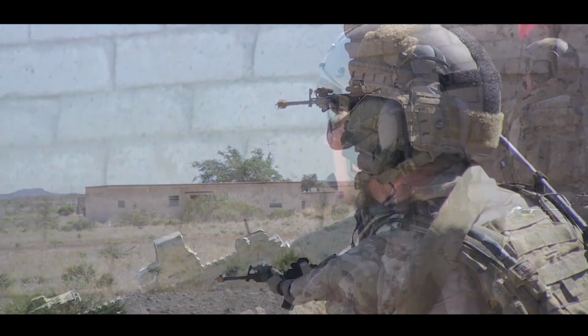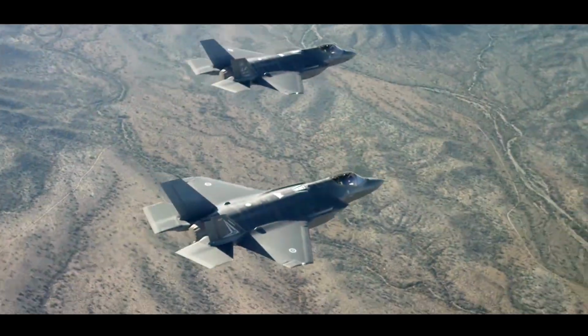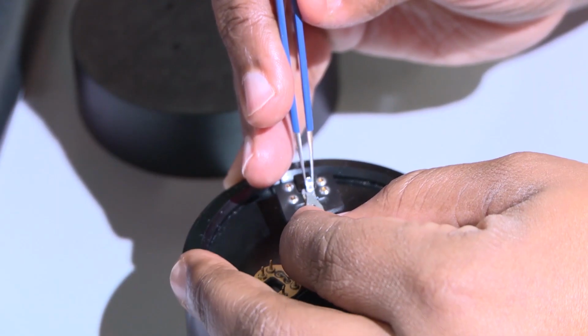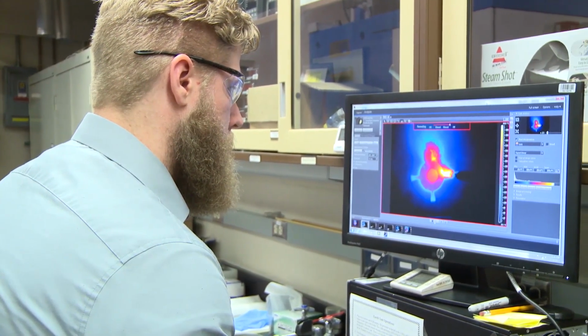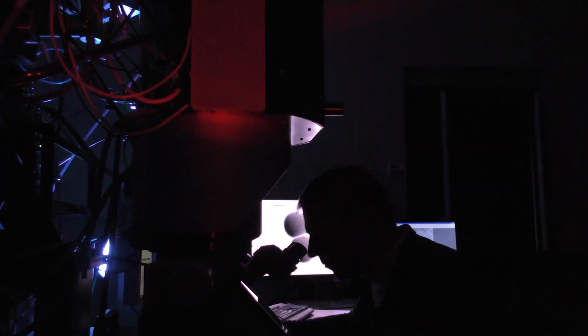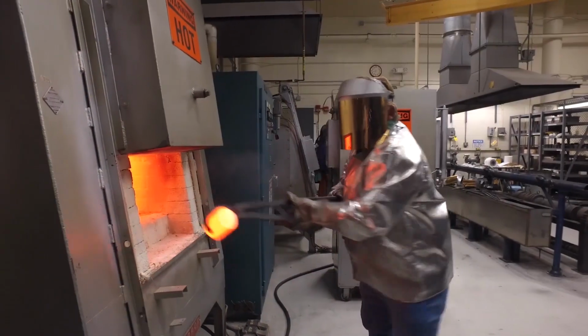So everything they do and everything they use comes back to a material that has a home in this research laboratory. Materials characterization is our ability to investigate a material and to quantify, to tell you what that structure is composed of. How strong it is, how dense it is, how well it reflects light, how well it conducts electricity.